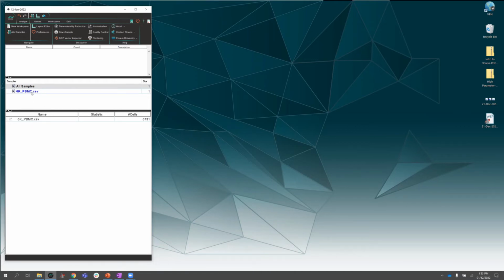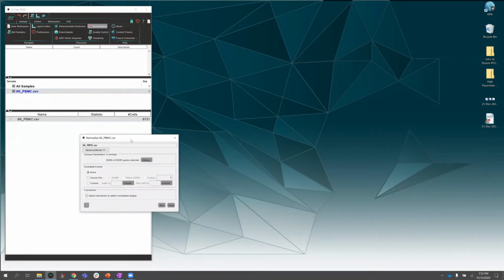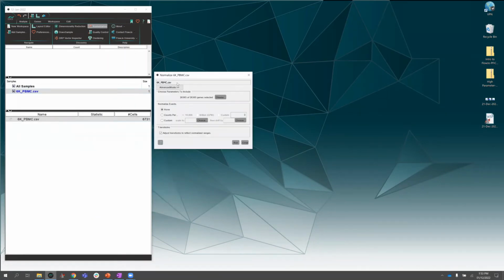Okay. So first thing we're going to want to do is probably do some normalization, right? So we're going to want all of our reads to be on the same scale. So we're going to go ahead and hit that sample and launch the normalization platform. So I'm going to hit that. And pretty simple, it's just going to ask me to pick the sample. It's going to ask me which genes I want to normalize.